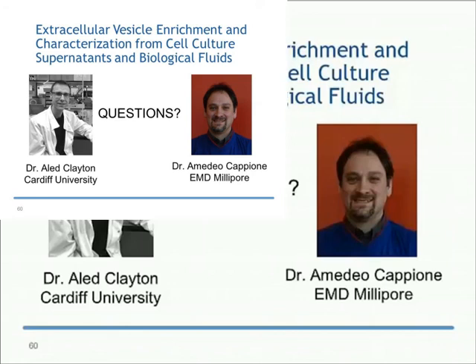We've had some attempts at handling tissue homogenates in the past. We've had some biopsy from prostatectomy. We've mashed those up and collagenase digested and taken the liquid fraction, if you like, off those digested tissues and tried to spin down and purify and look for any evidence of exosomes in the supernatants. And it's something that's been really, really difficult to generate compelling evidence that we've got genuine tissue-derived vesicles in the system, especially given the amount of debris and membrane fragments that's going to be around in the system.